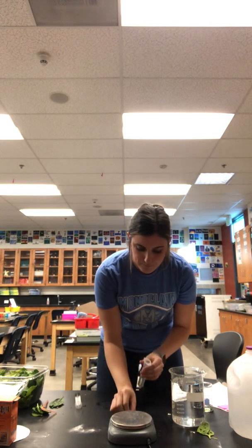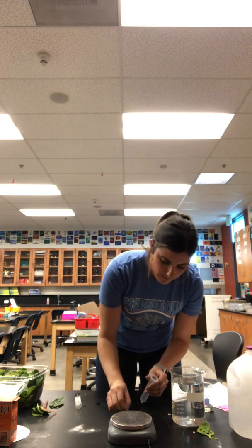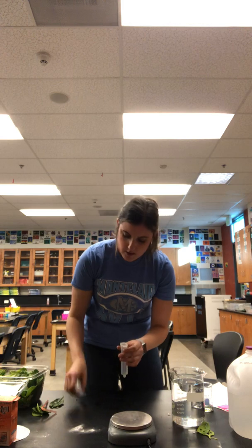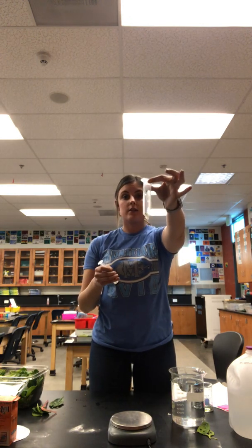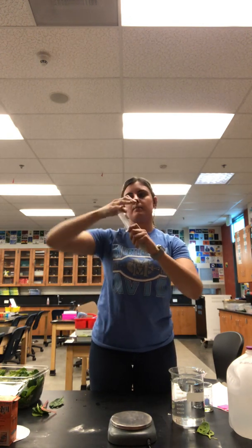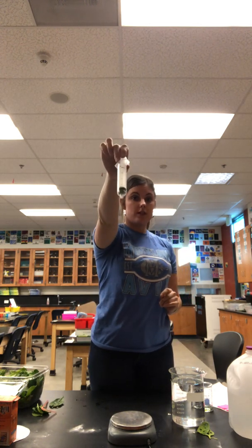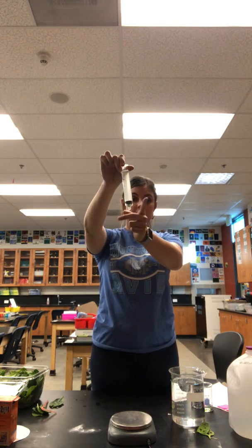They've fallen. Okay, once our chads are in the syringe, go ahead and place the topper back on. Now we have a closed syringe with the leaf chads inside.